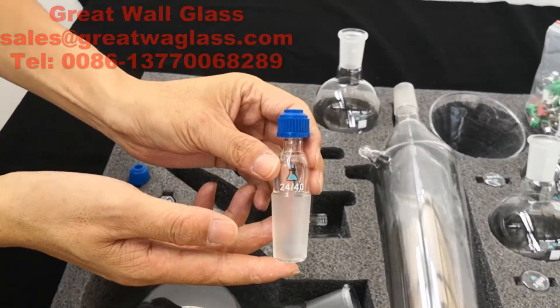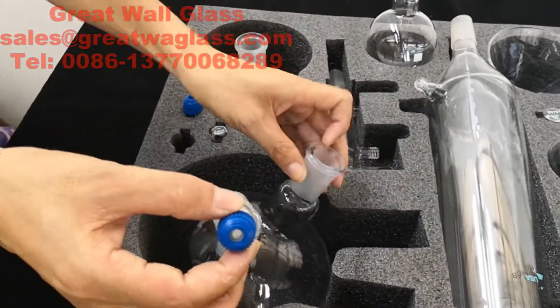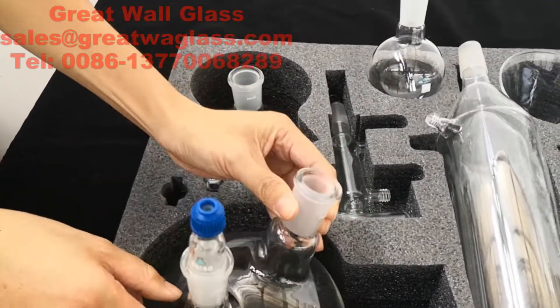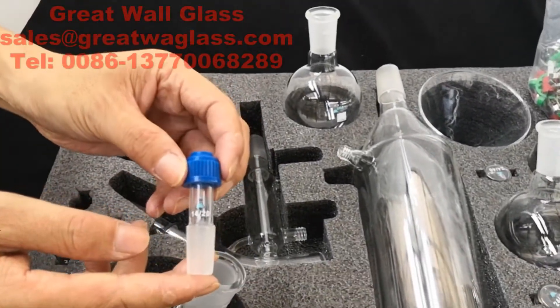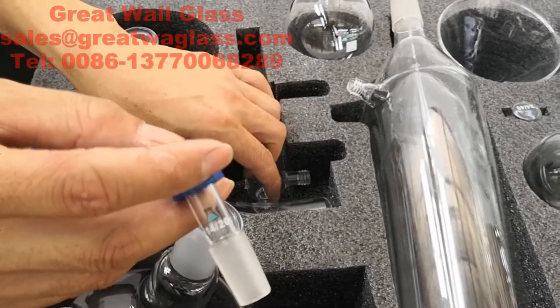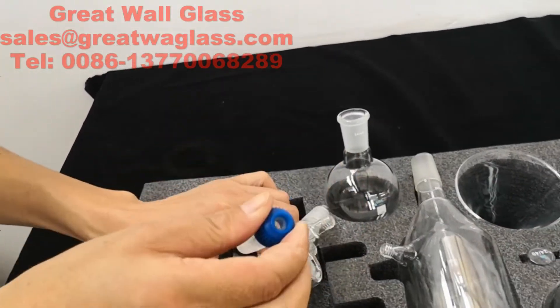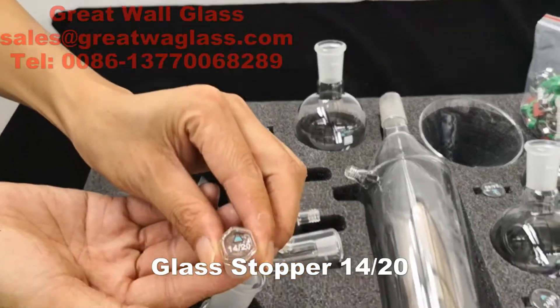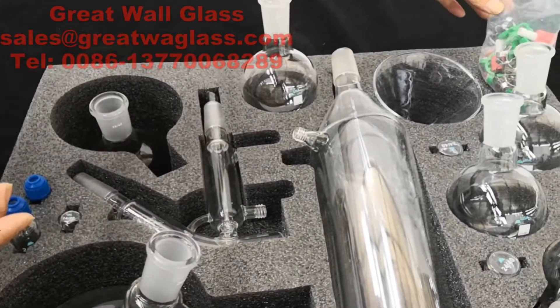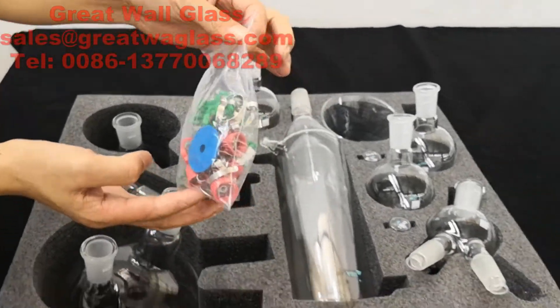One piece of glass thermometer adapter. One piece of smoke meter adapter, size 14/20, installed here. One piece of glass stopcock. One bag of spare parts. That's all.